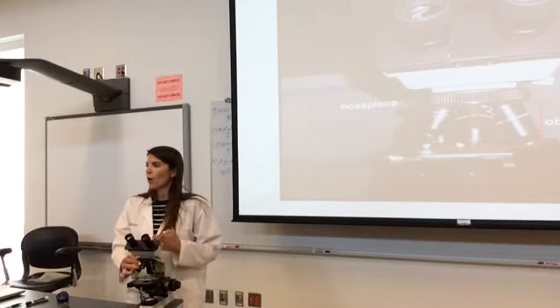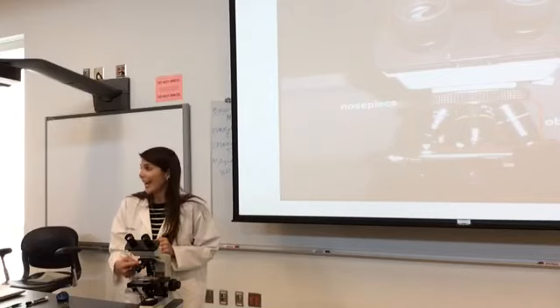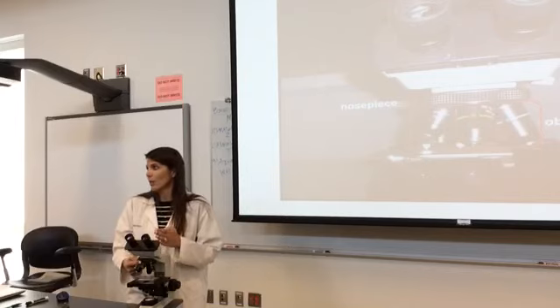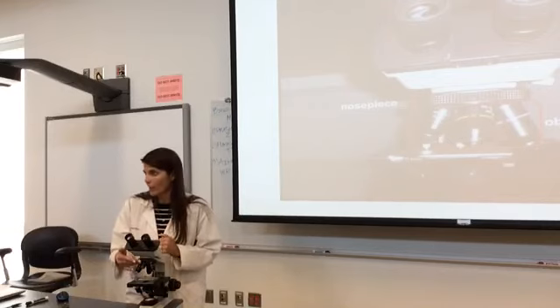Depending on where you are studying, we either call the smallest objective the scanning power, or we call it the low power. I am not going to force either one on you, but you need to know both. Because when I was at A&M, we said scanning, and at UT, it was low power. It just depends on who you're with, and you need to be educated enough to know that if they're saying scanning, they're not talking about some other objective.